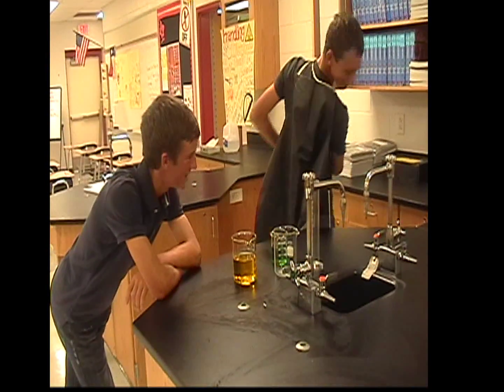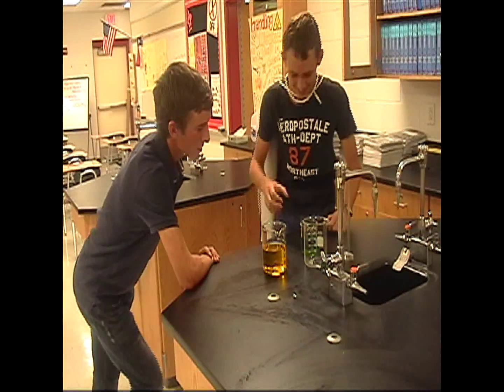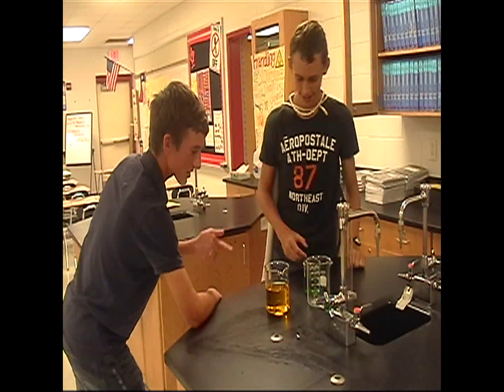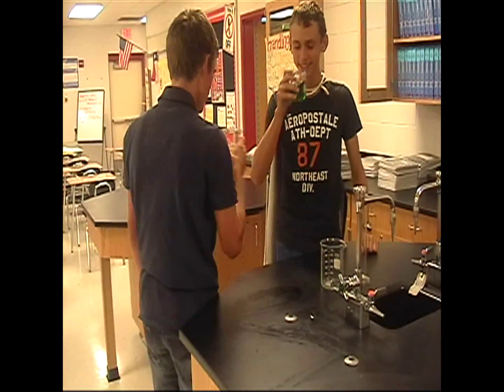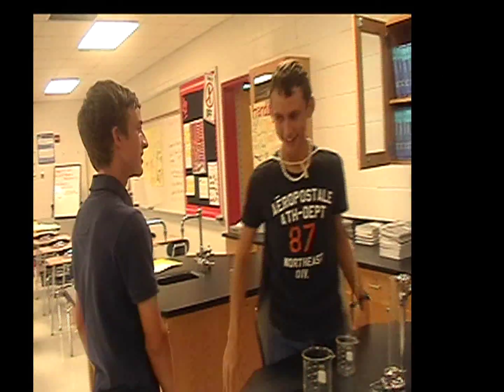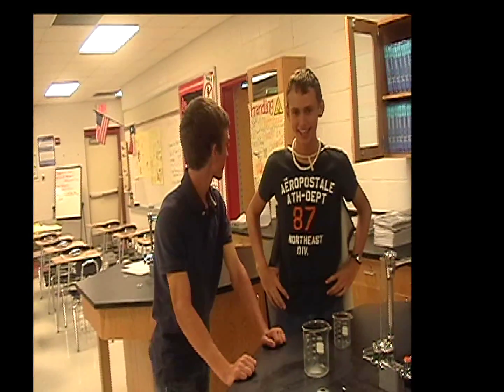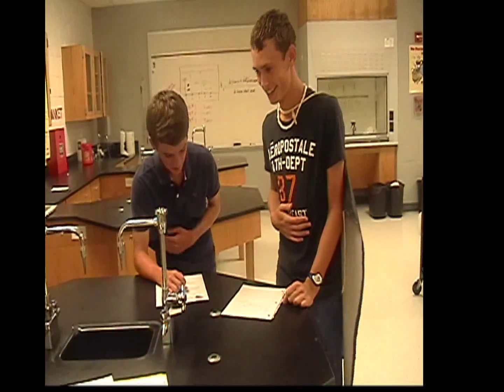Notice how they're not wearing their safety equipment correctly. One character says he's pretty thirsty, and the other agrees. They spot something nearby and decide to drink it. Afterward, one says 'that hit the spot,' but then both start feeling sick, unsure of what happened.